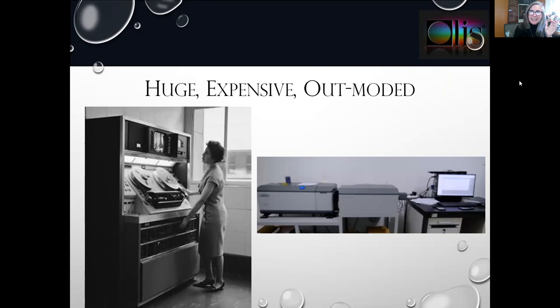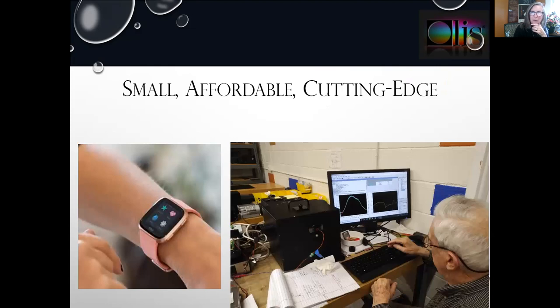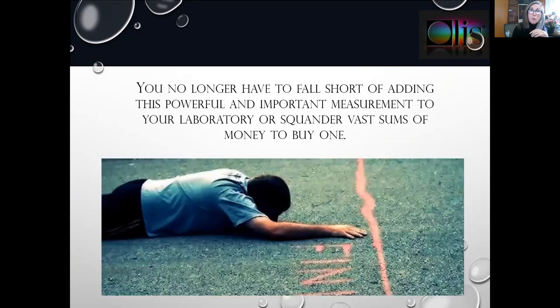Just to remind you what the old one looks like — nice and large, expensive, and entirely outmoded. The CPL solo, on the other hand, is small, affordable, and clearly cutting edge. Therefore, you no longer have to fall short of adding this powerful and important measurement to your laboratory, nor do you have to squander vast sums of money to buy one.